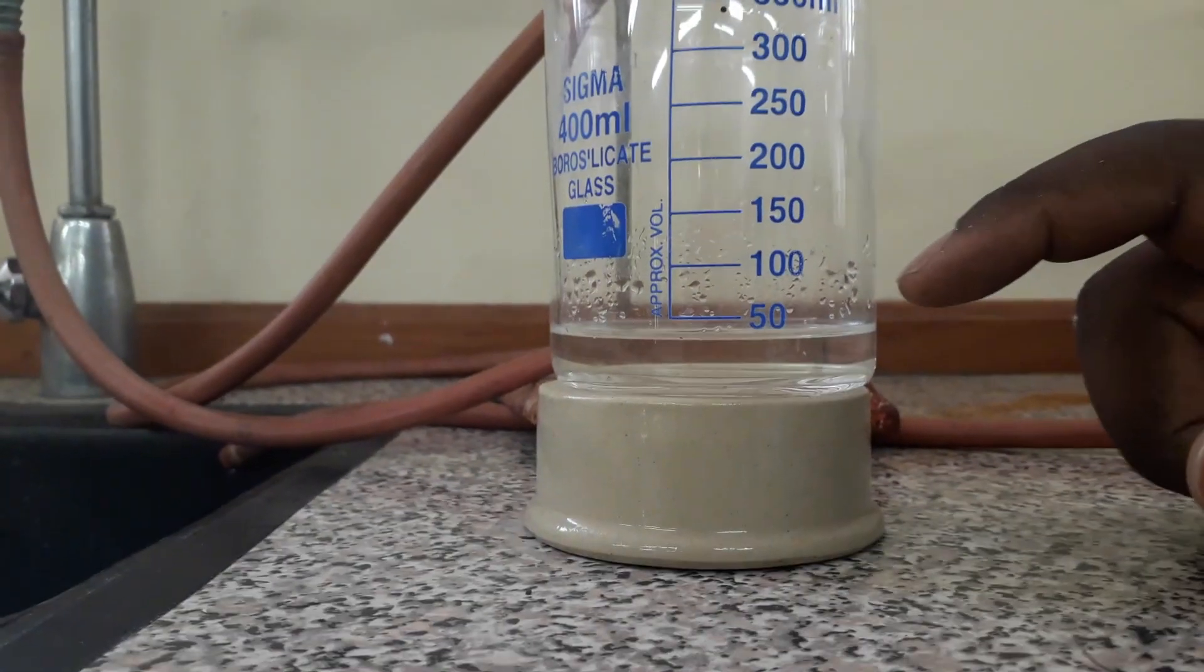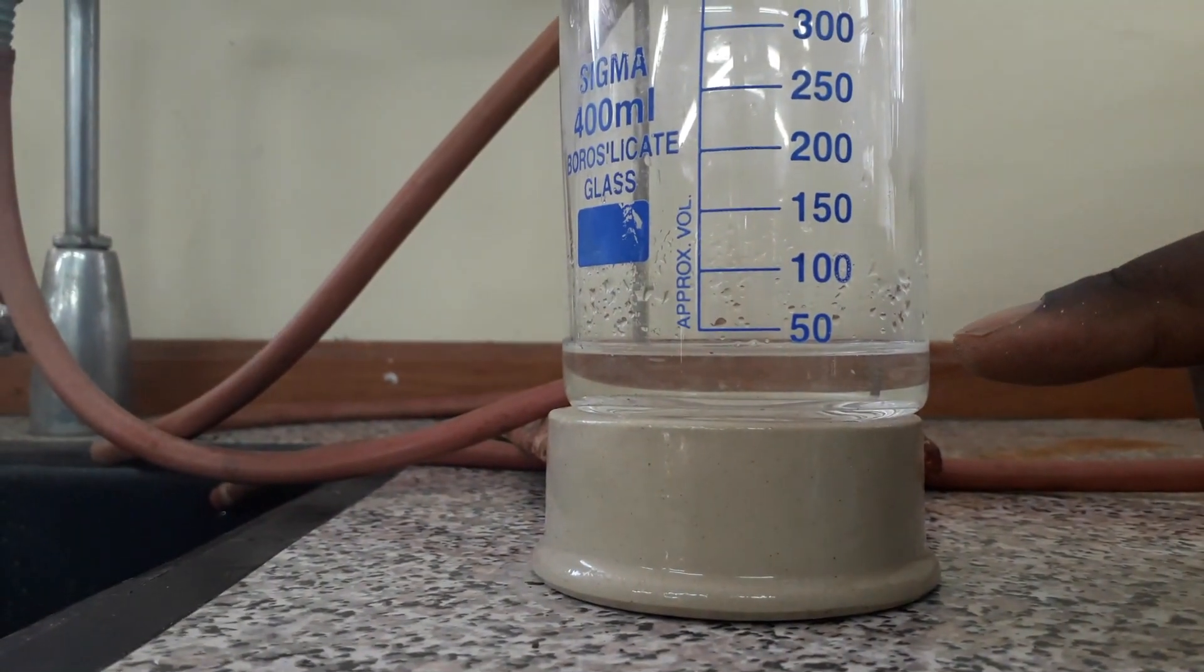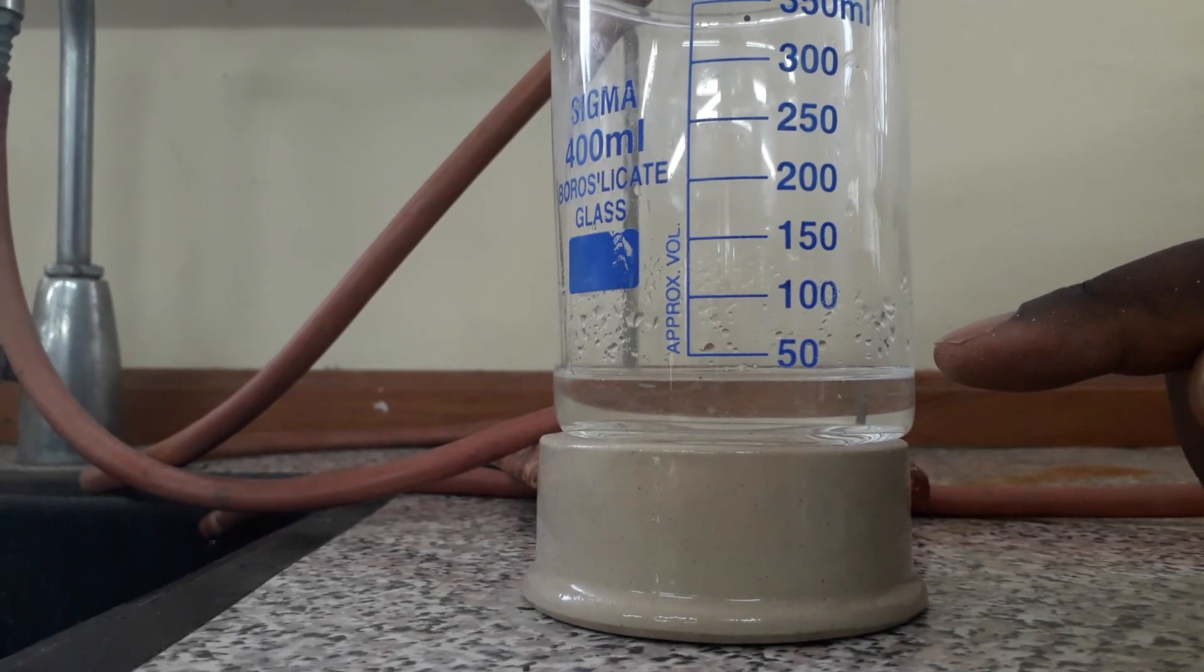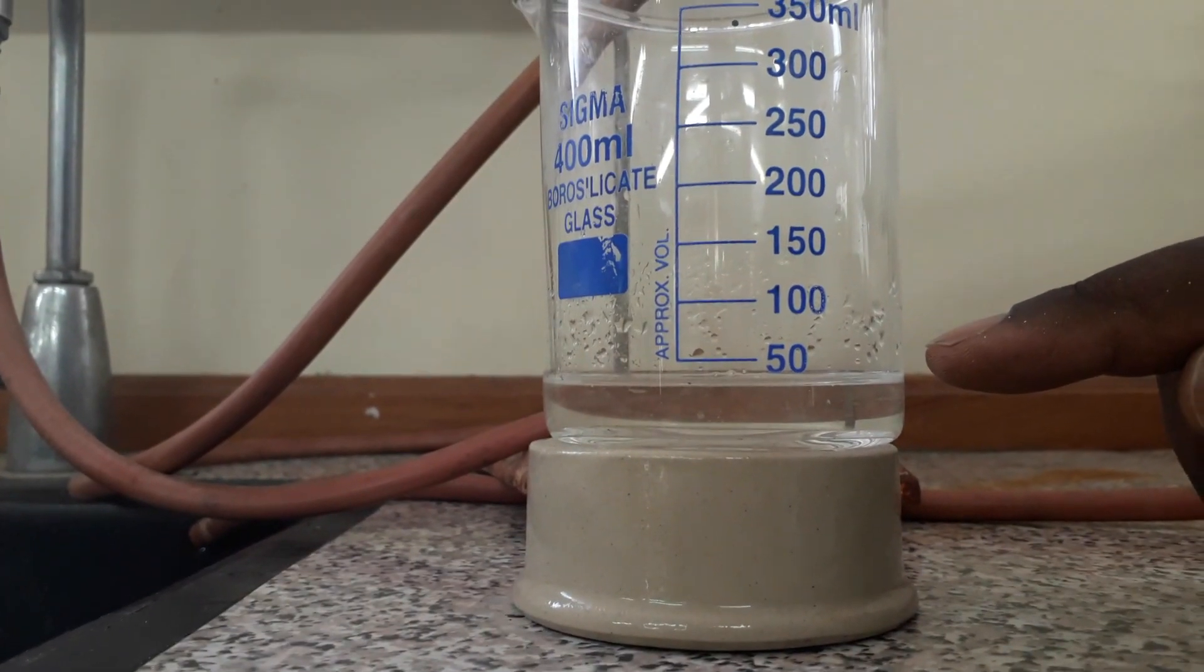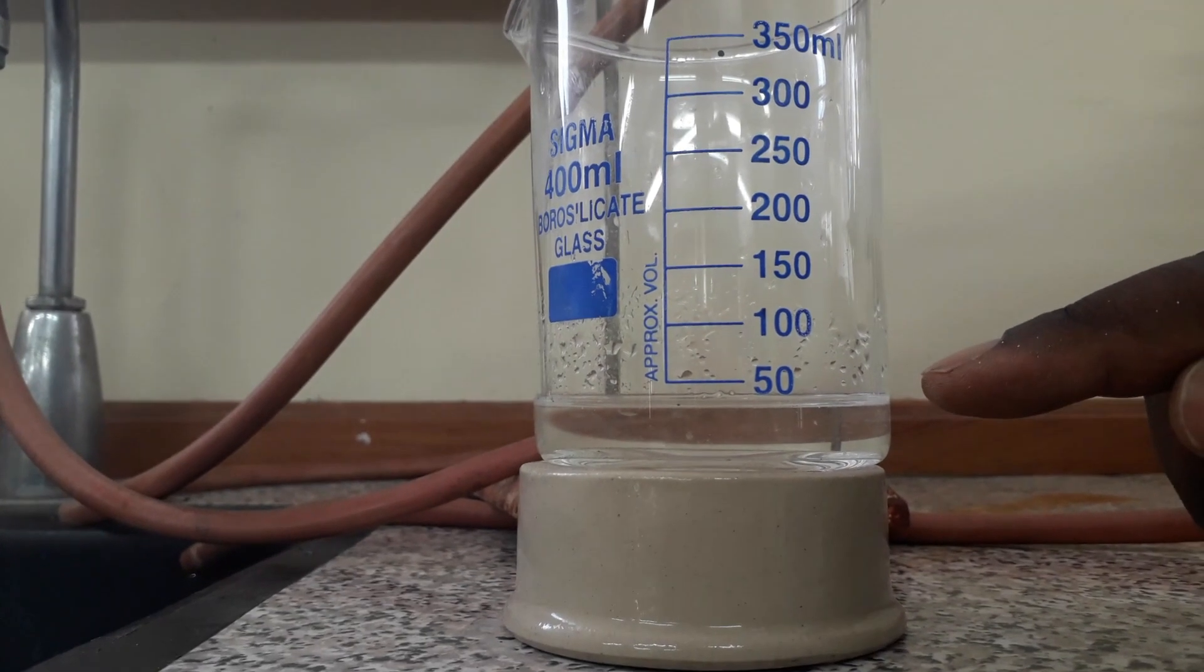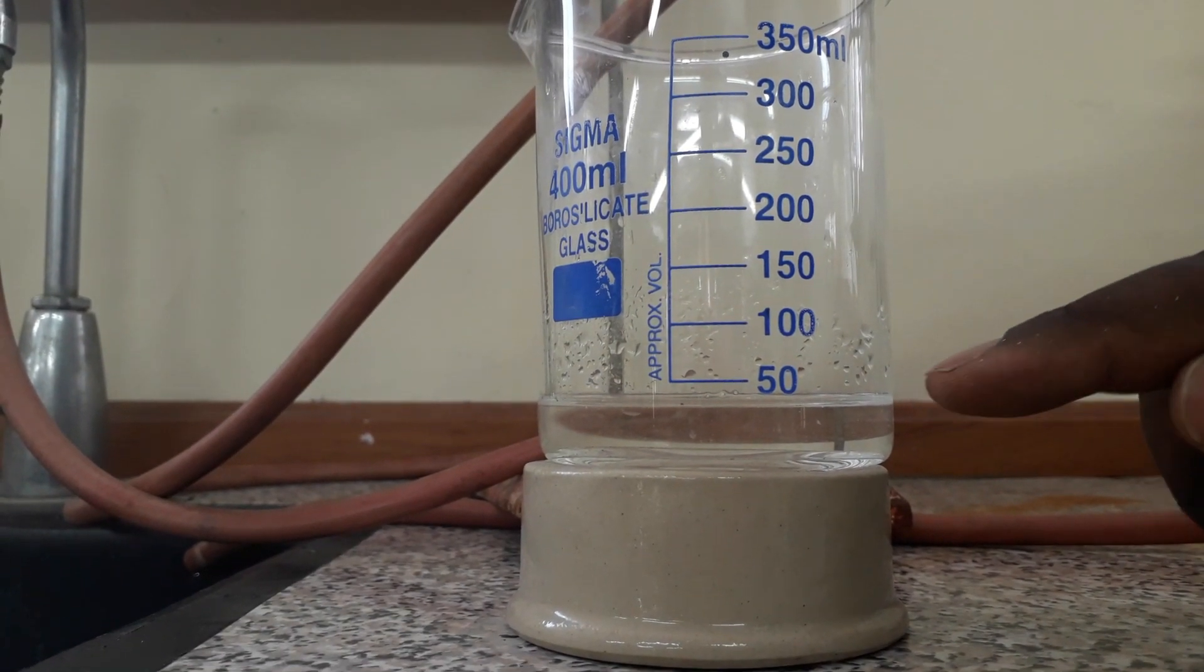So if we're looking closely at our liquid, we will see that we have a large layer at the bottom and then a very thin layer, oily layer at the top. A water layer at the bottom, which is a thicker one and a thin oily layer on top.